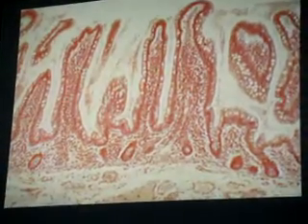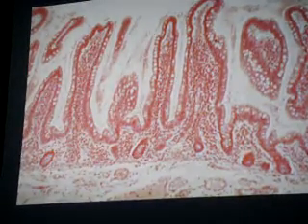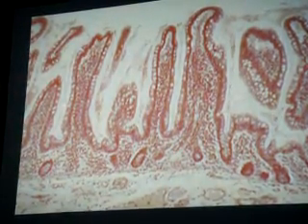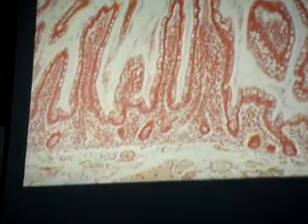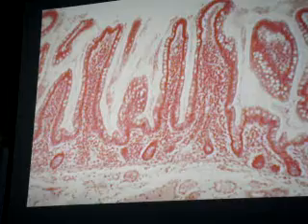So that's all you need to know for the slide of the ovary. Classify pointed tissue. Be specific. Classify pointed tissue completely. Be specific. Simple what? Columnar epithelium with goblet cells. So identify pointed structure, goblet cells. Classify pointed structure or gland according to the number of cells. Unicellular.